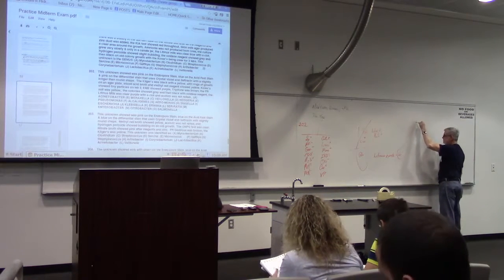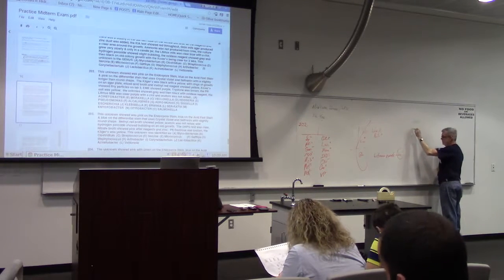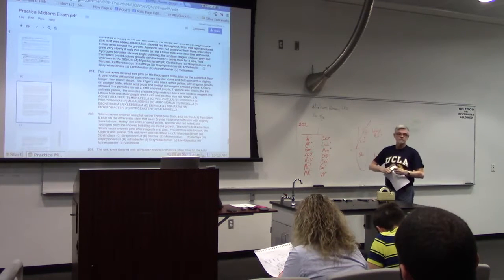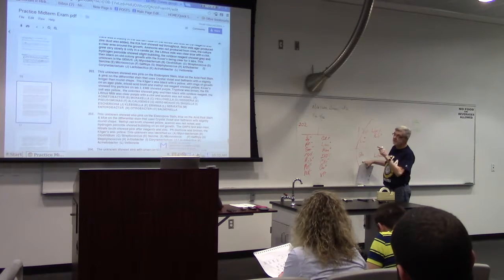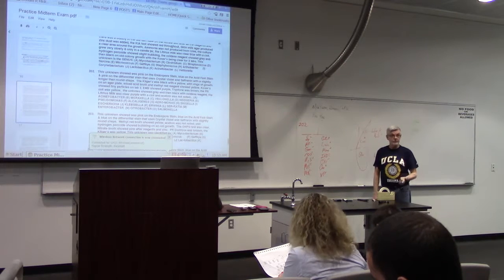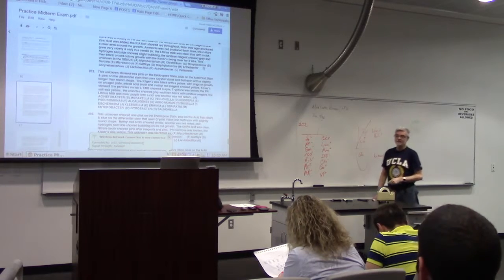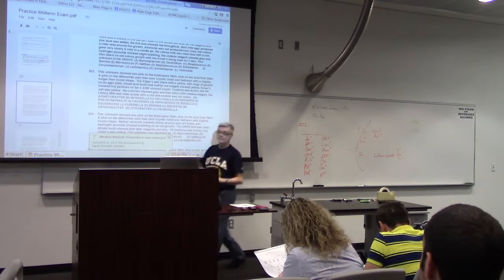If glucose is positive, then... if glucose is negative, then... So you're going to get two answers. You mean lactose, right? No, I mean glucose. There is nothing to tell us our glucose result except it said Kligler's was yellow. Did it mean yellow all the way through? Or did it mean yellow only at the bottom? But our other test told us it was lactose at the top, so we know one of them was positive.